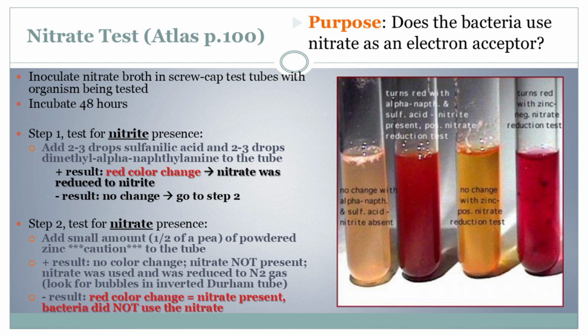And red after zinc means our bacteria haven't touched the nitrate. You've got it. It's a three-part mystery, each outcome revealing something crucial about how these bacteria function.